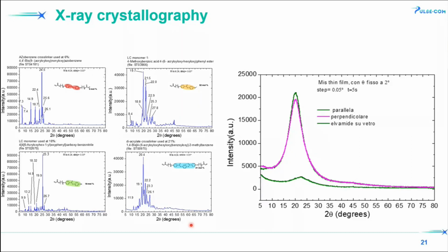The smectic phase usually is lower in temperature than nematic. So if you have polymerized in the smectic phase, you will have sharp peaks that indicate layer formation, and actually not only orientational but also positional ordering of the liquid crystals in your PMP.